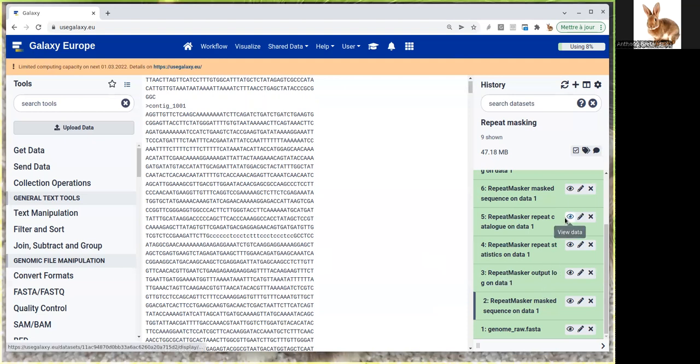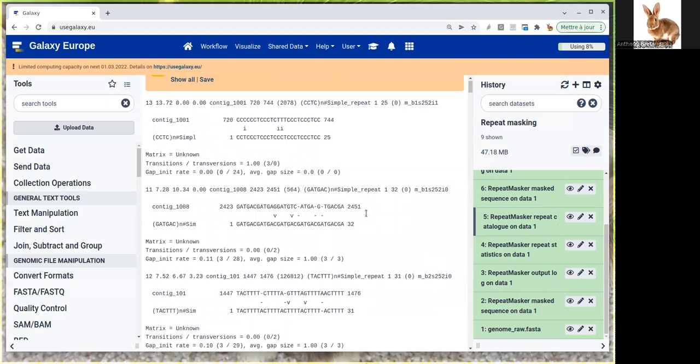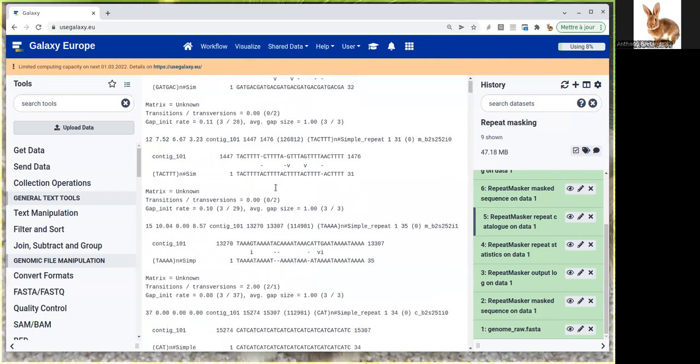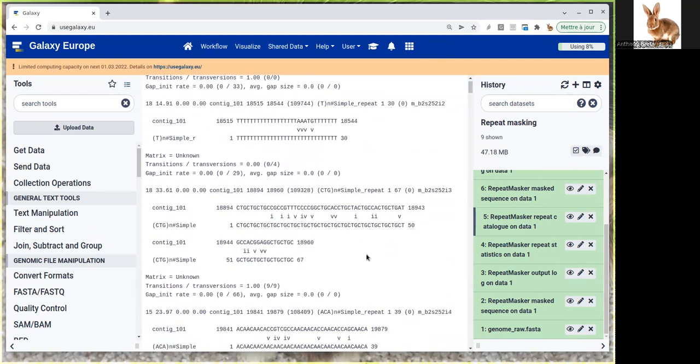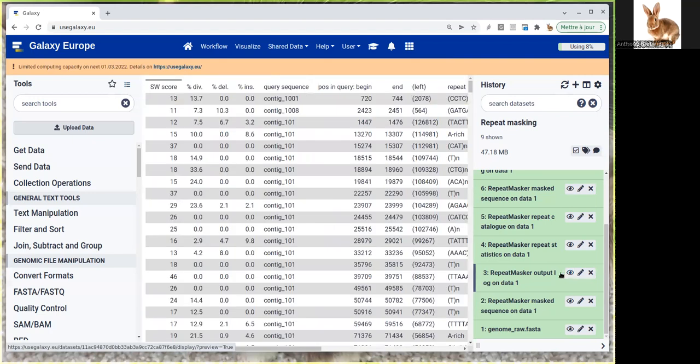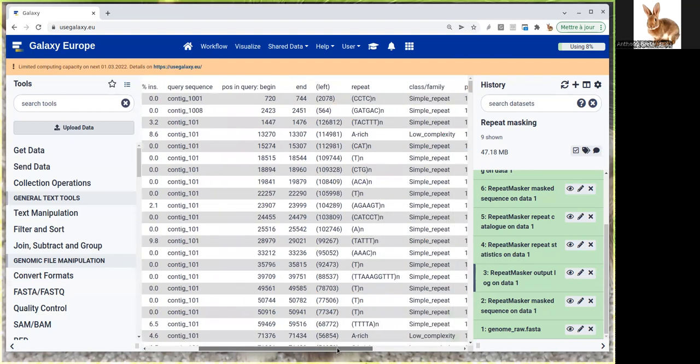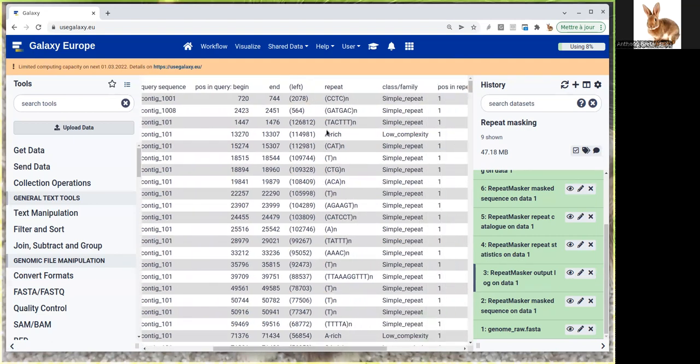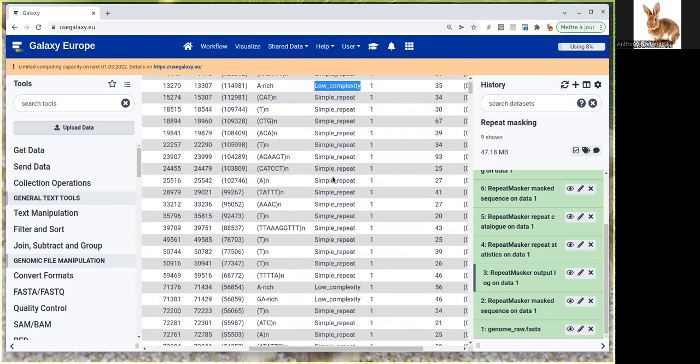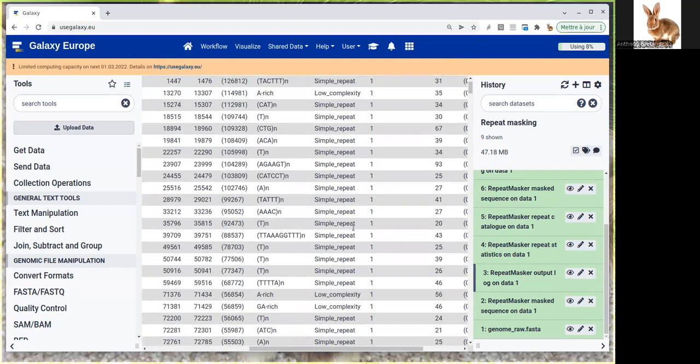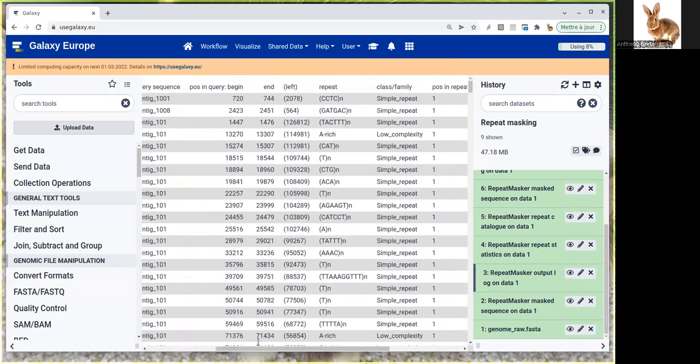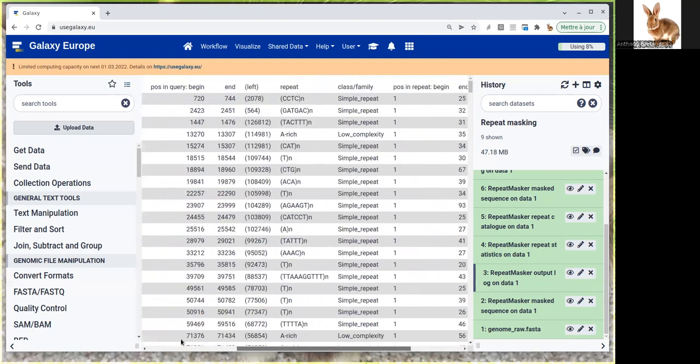The first is the repeat catalog, which is just a list of all the repeated elements found in the genome with the position, scores, and exact differences between each repeated region. You also have the output log, which tells you exactly where repeated sequences were found with the exact sequence of the repeat, the kind of repeat (because there's a whole classification—simple repeats, low complexity regions, etc.), the position, score, and other details.